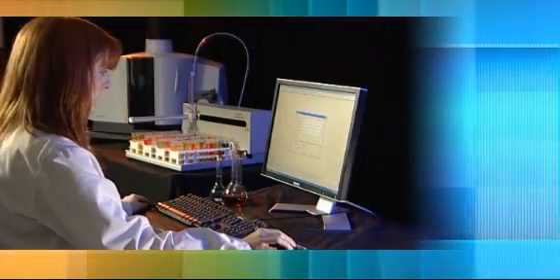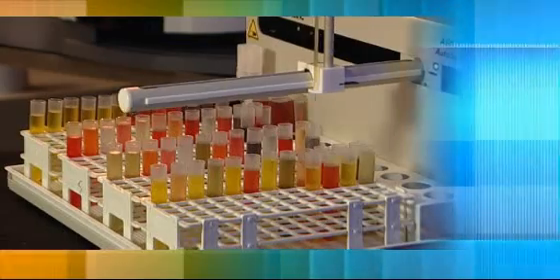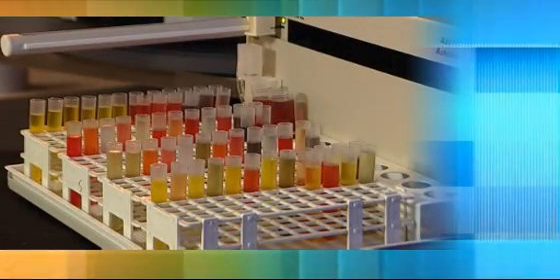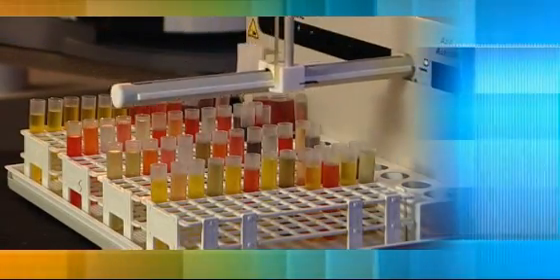The iCAP 6000 series comes with a host of productivity enhancing features that will make your laboratory more cost efficient than ever before.